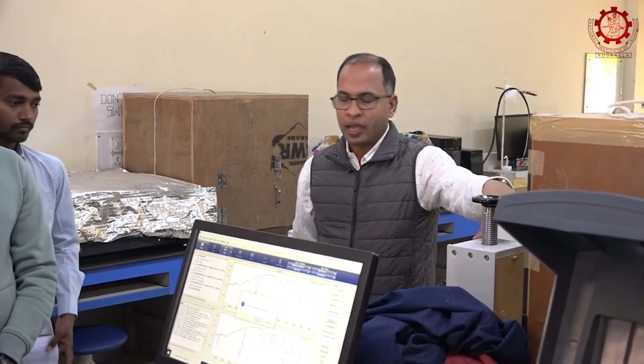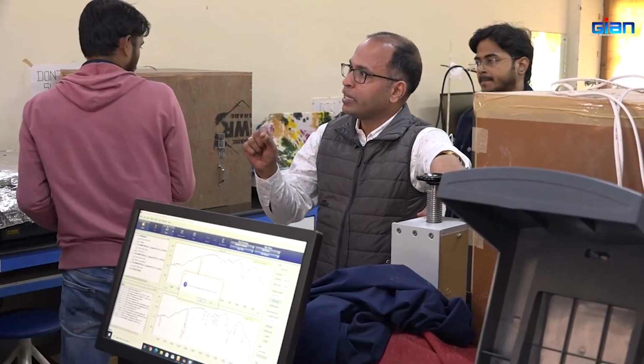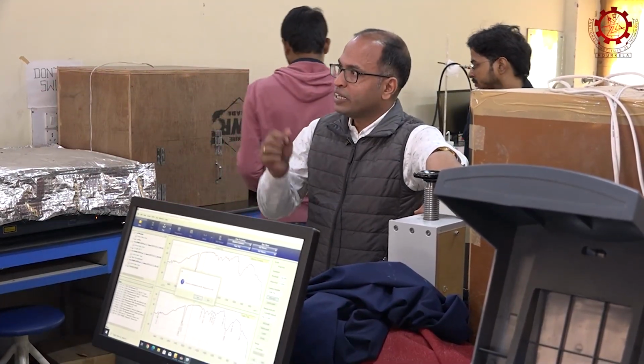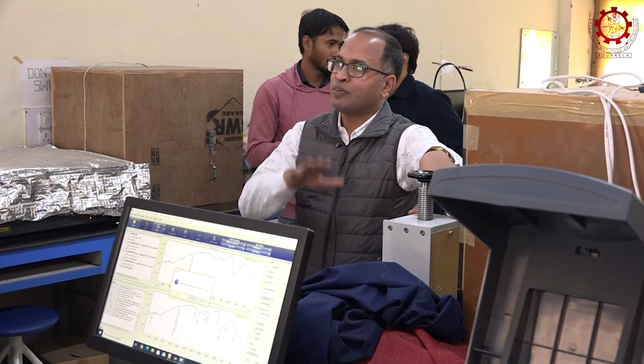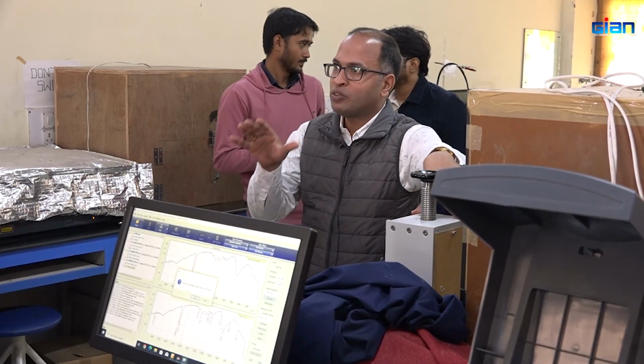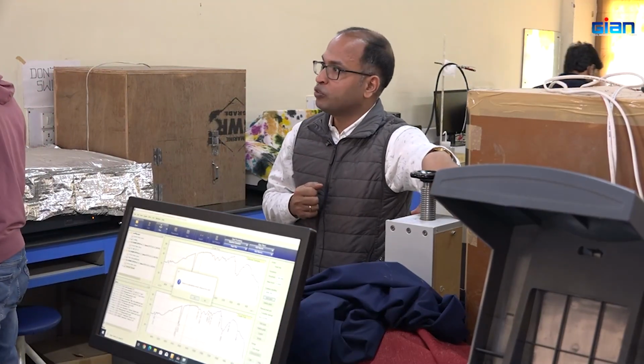So this is where we will make the pellet. Again I told you we need to make it uniform. So when we are using potassium bromide and our compound, it is a solid mixture. In solution everything is uniform, but when we are making a solid mixture, if you do not grind it properly, it will not be uniform.